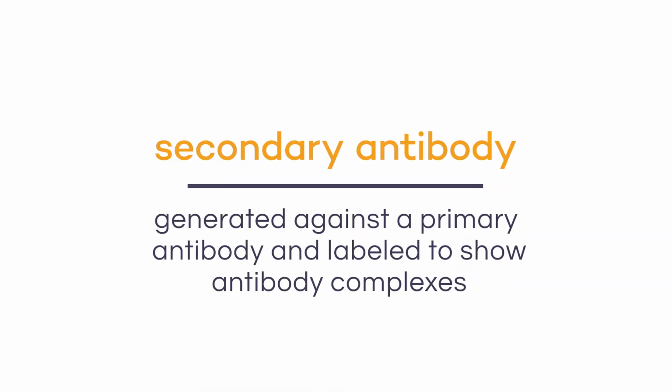Now that we know all there is to know about a primary antibody, let's talk a little bit about what our options are when it comes to secondary antibodies. Secondary antibodies are antibodies generated against an immunoglobulin. That means they'll be able to bind to your primary antibody.